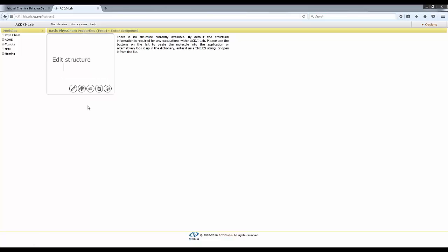In any case, the first time you access iLab, you will see a lot of warnings for Java and security and whatever. You should accept all of them, and then it should work fine.